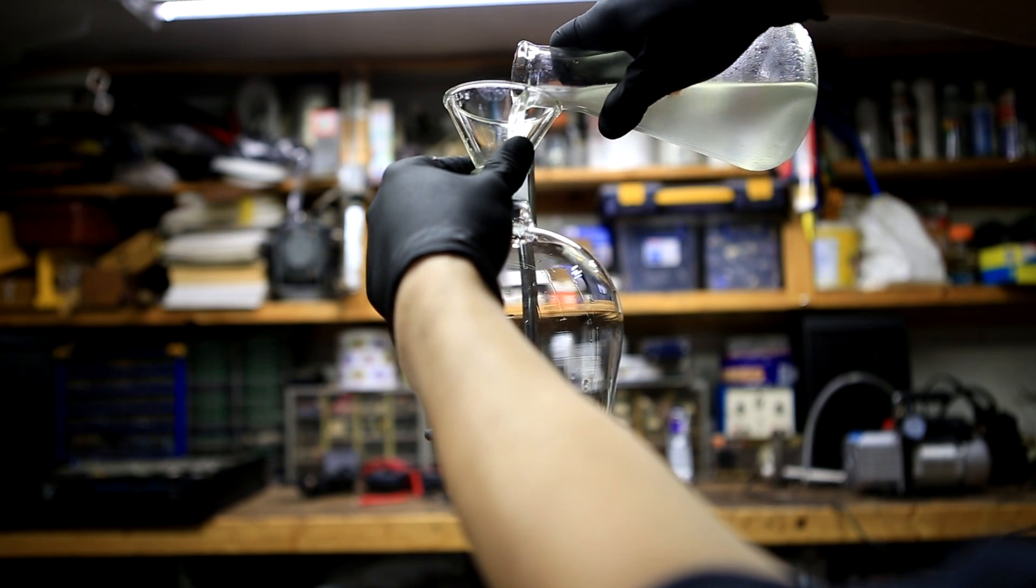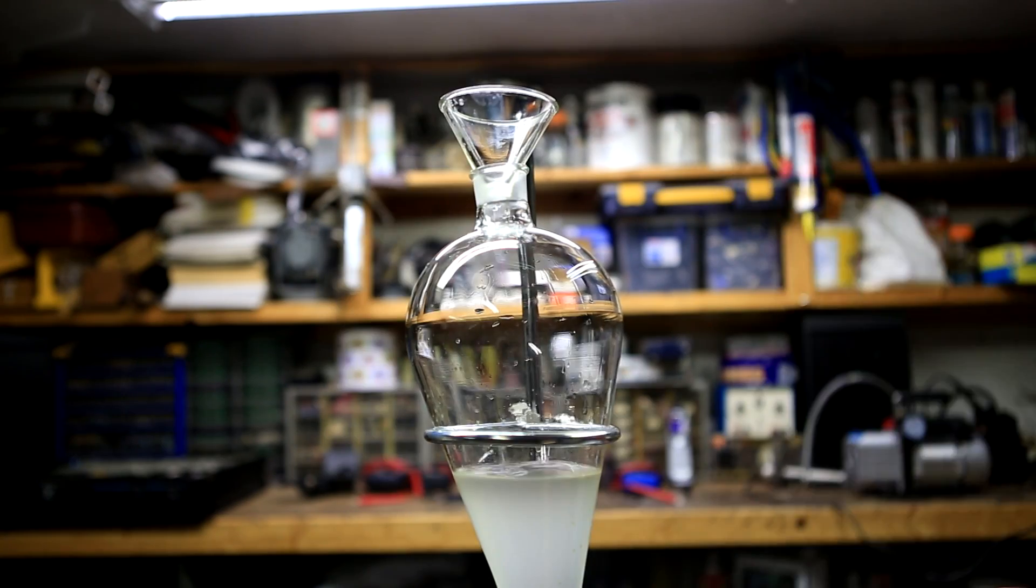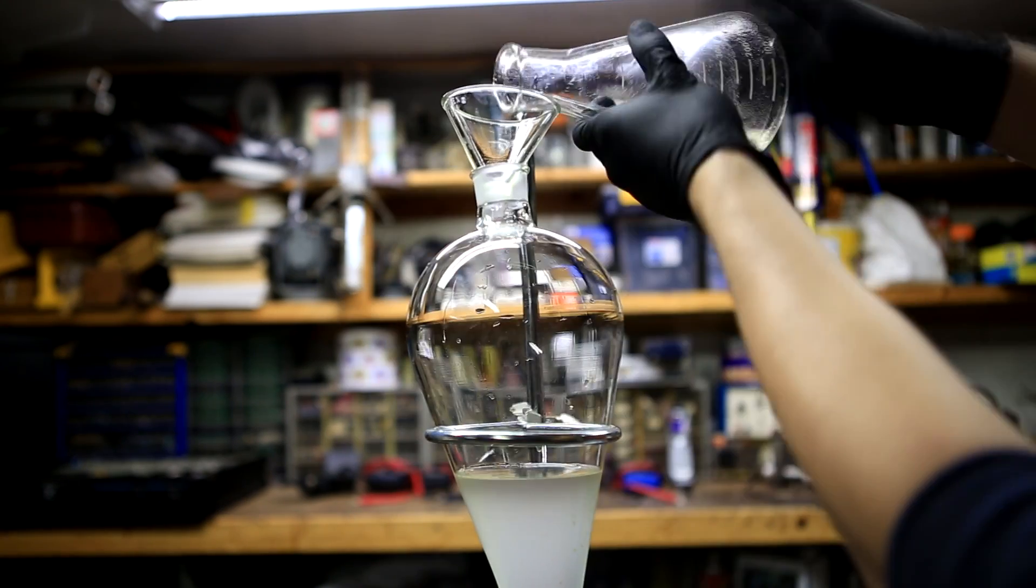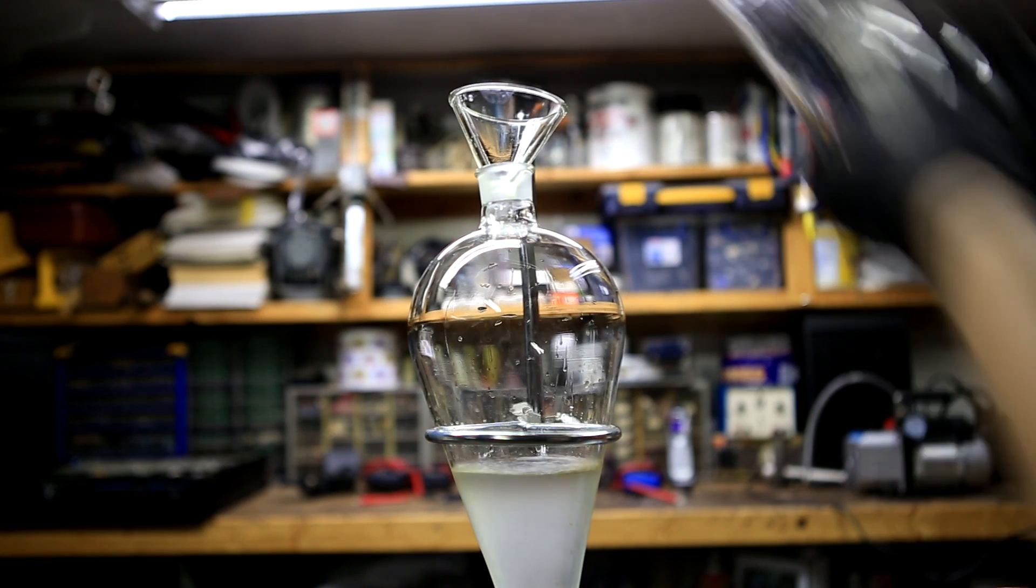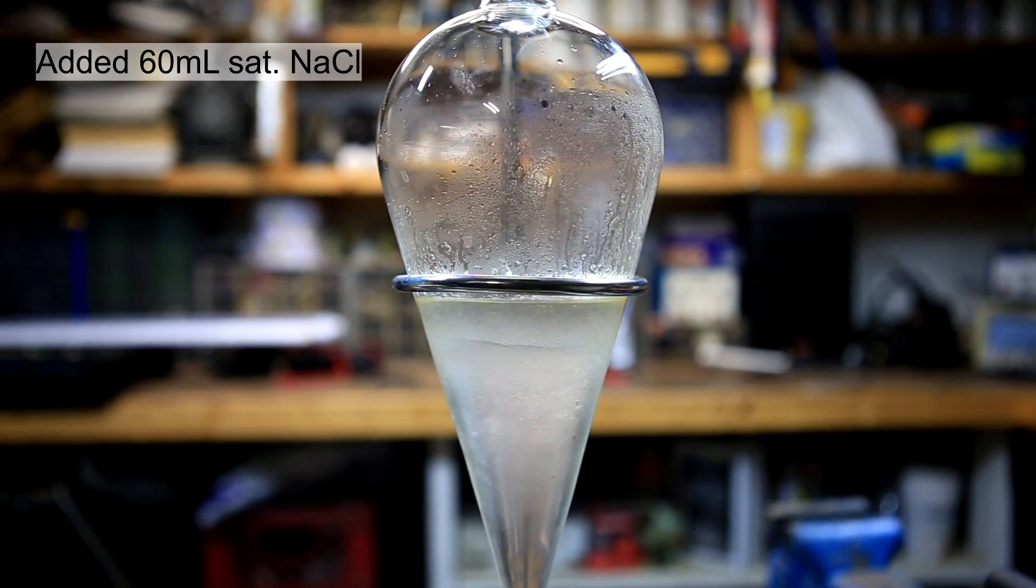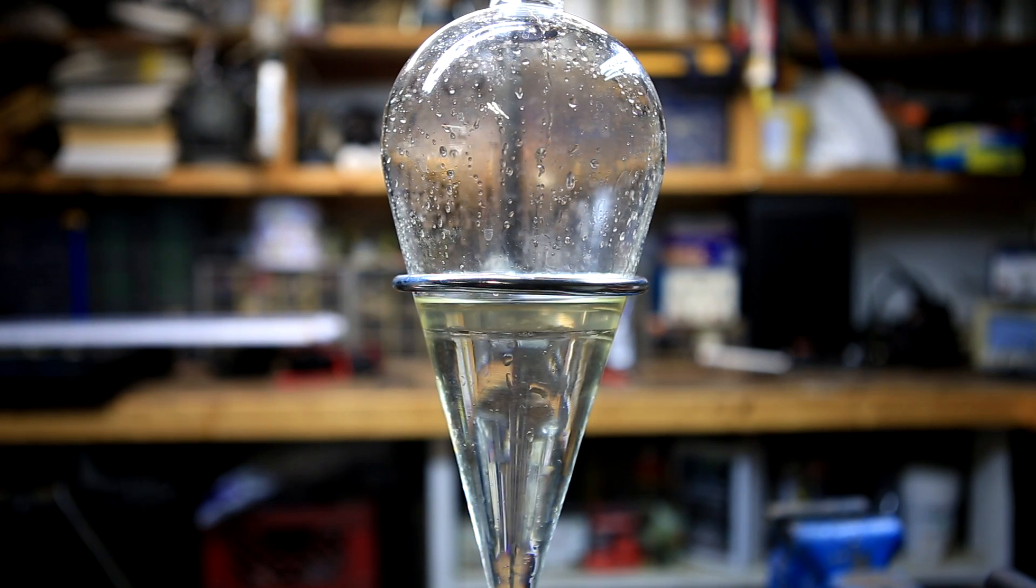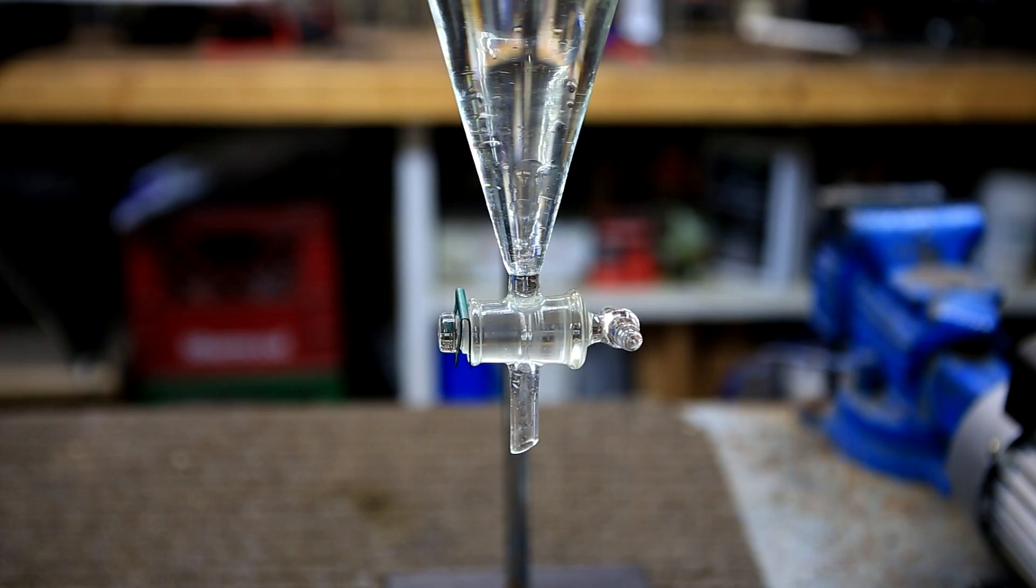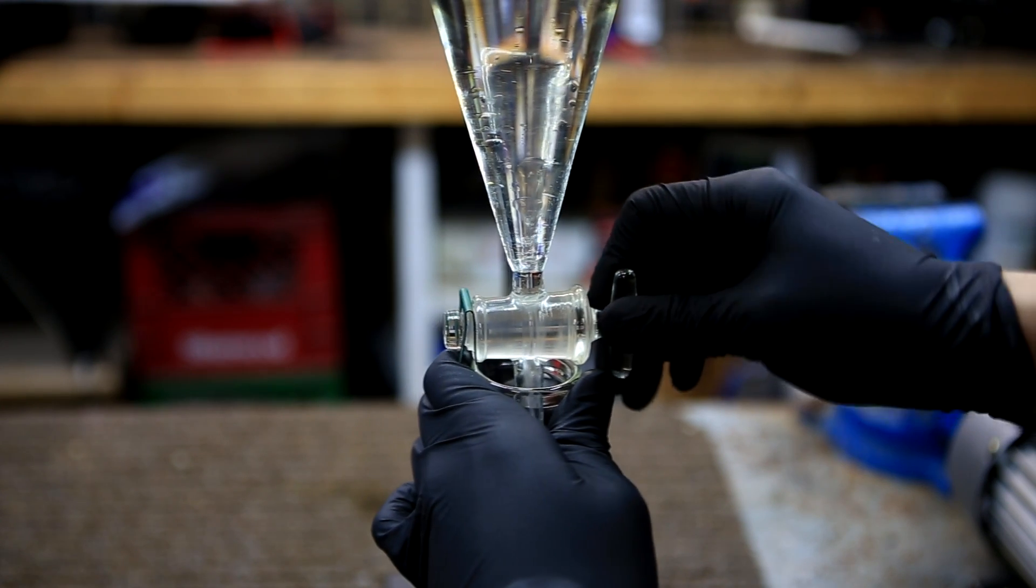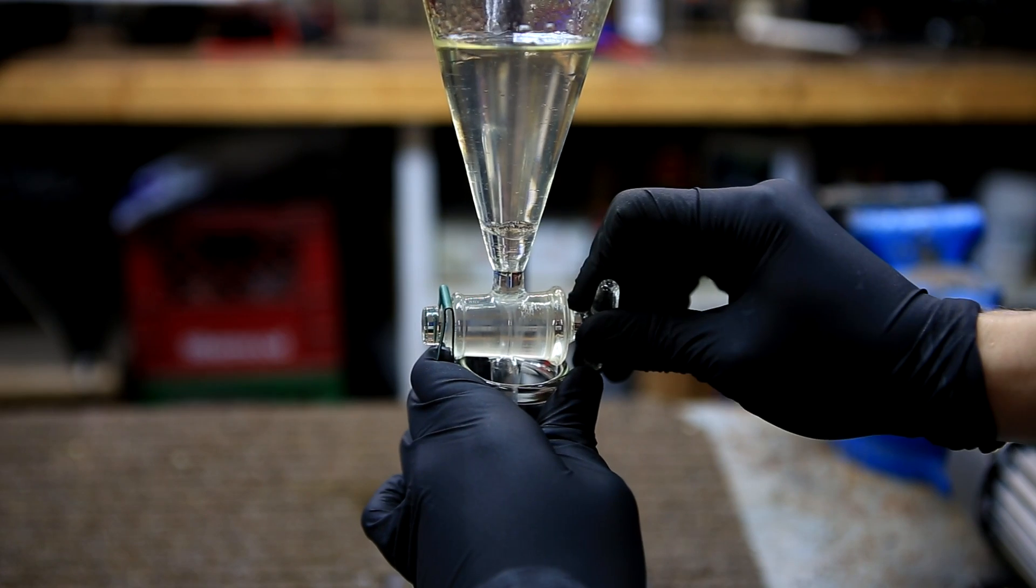The combined dichloromethane layers are re-added to a now clean separatory funnel. The Erlenmeyer flask is washed with a small amount of DCM. 60 milliliters of saturated sodium chloride solution are added to dry the organic layer. After capping and shaking and letting the layers settle, you can see that the DCM layer is much clearer now.